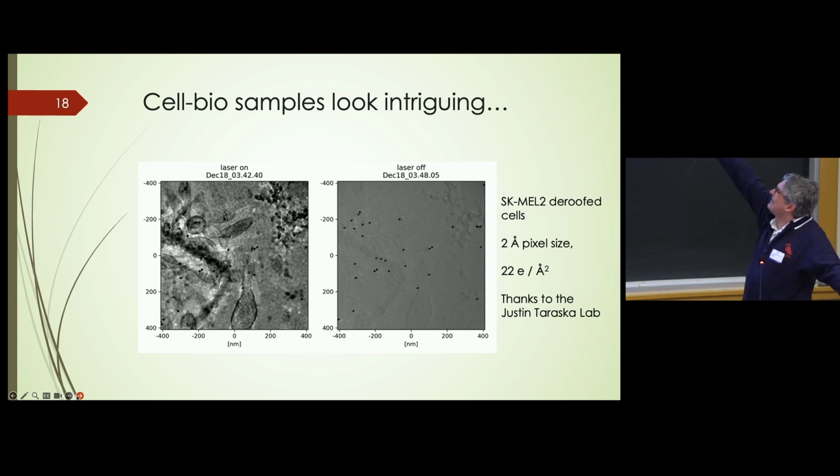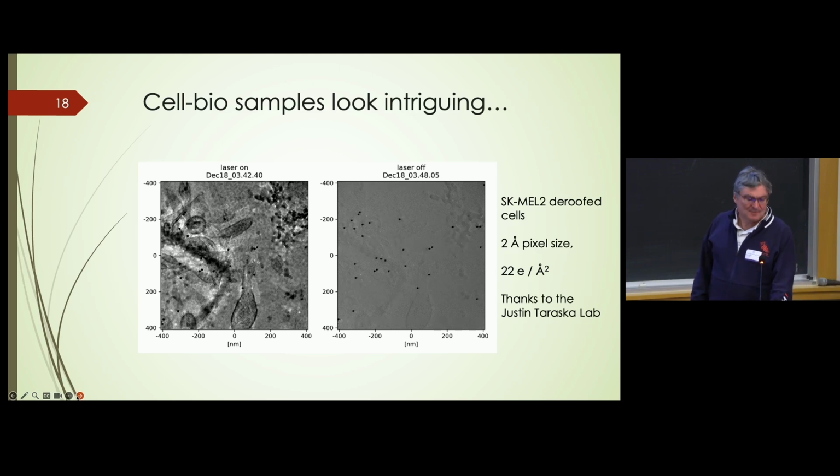For a short time, we thought maybe these are ribosomes, but it's probably just structure in the ice. And this is the same specimen imaged right after that without the laser. And it's not a totally fair comparison because this is when the specimen was fresh. This is when it was already exposed once. But very clearly, you can see how the contrast enhancement helps here, right? Okay. But how about tomography?